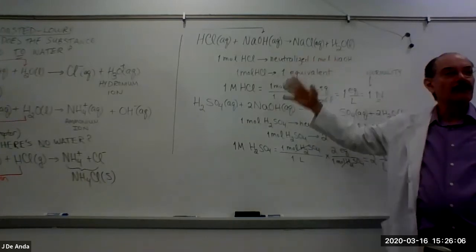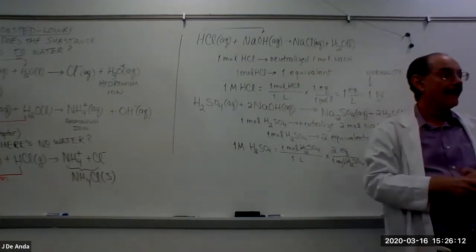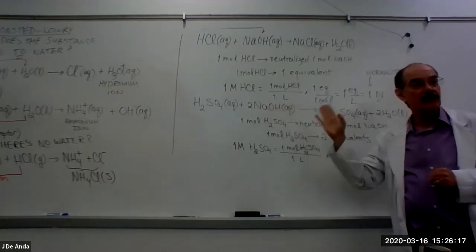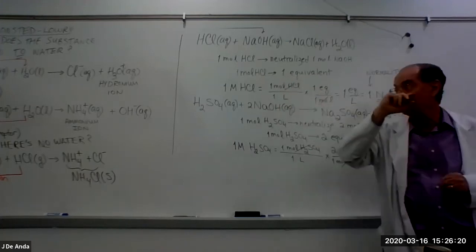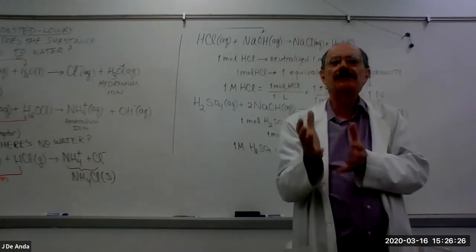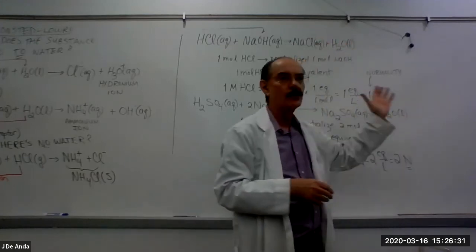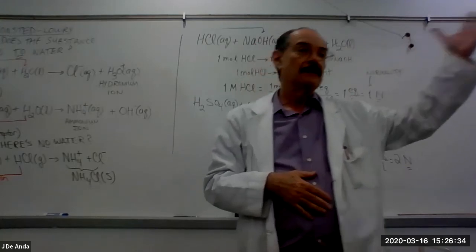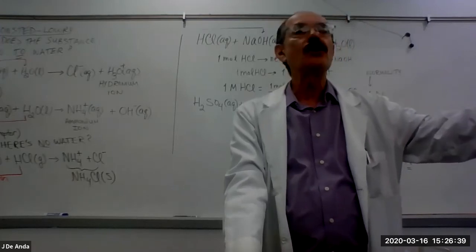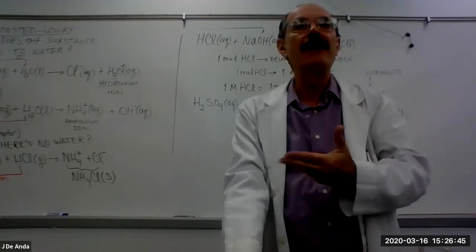Since these reactions between acids and bases are very coordinated by the stoichiometry, and since I have a way of relating the stoichiometry of the reaction with what I had in there, if I have a solution of one of them and I want to find out its concentration, I can simply run a chemical reaction against another reactant for which I know the exact amount and use the stoichiometry of the reaction to calculate the concentration of my unknown.